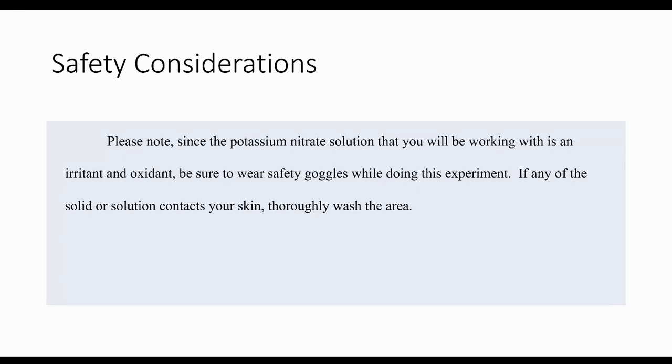So what you're going to do is take potassium nitrate solid and essentially dissolve it in water. Potassium nitrate is an irritant and oxidant. So normally you'd wear your safety goggles, and if you got any on your skin, you would wash it thoroughly.